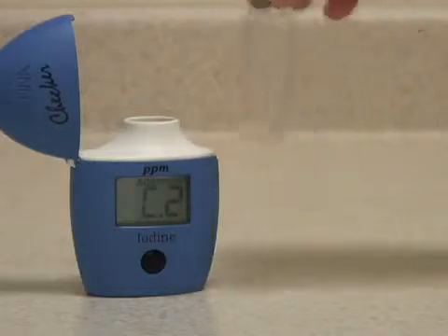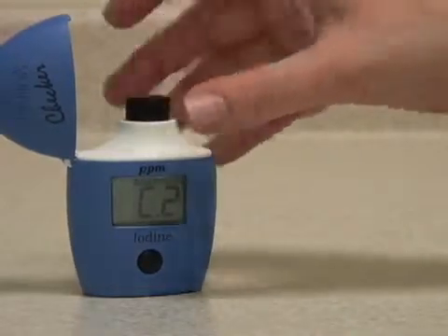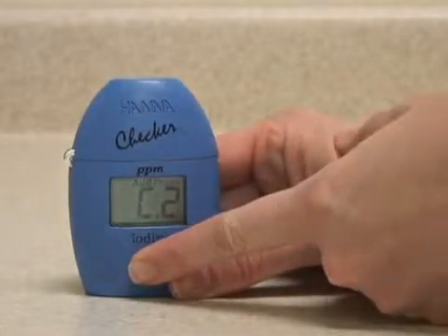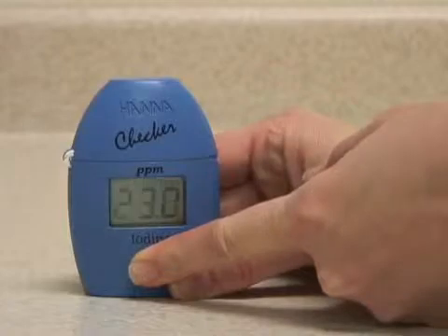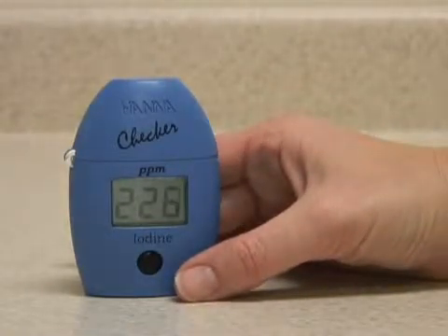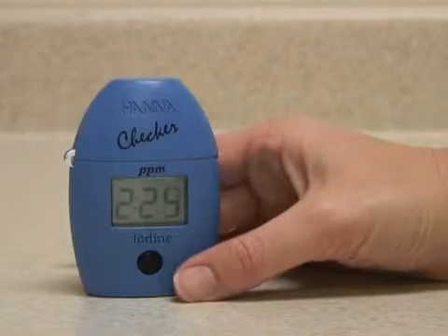When the reagent is mostly dissolved, put the vial back in the meter, close the cap, and press and hold the button to activate the read time function. The meter will count down 2 minutes and 30 seconds reaction time and then analyze the sample.